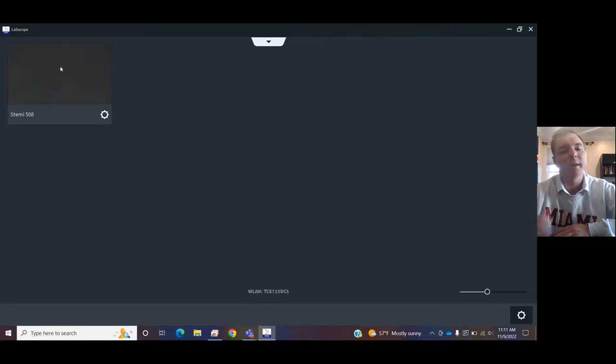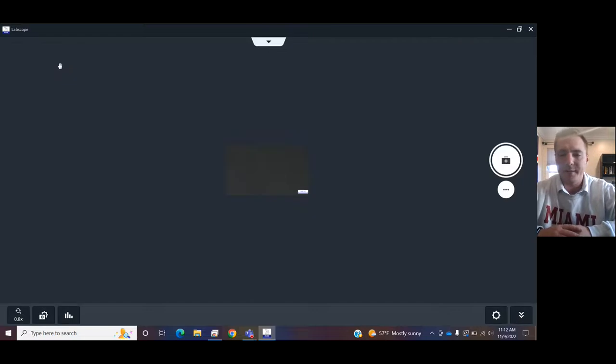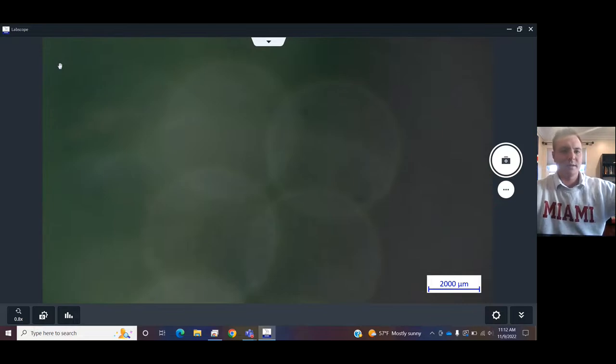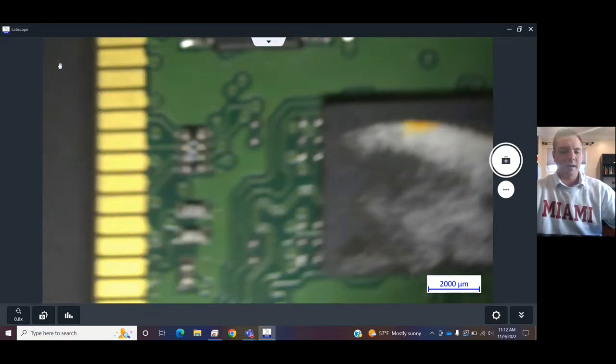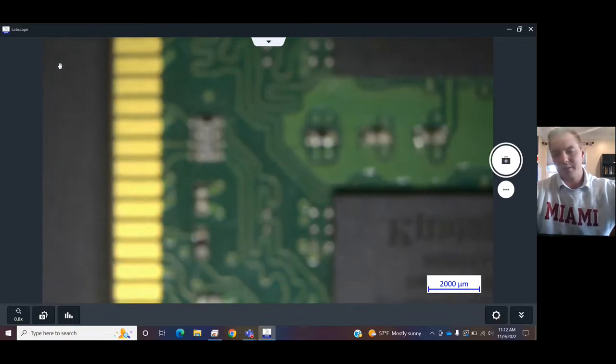So now that that's set up, we can click on this, and we will have our live image. Press down and scroll back out and get your sample in focus.